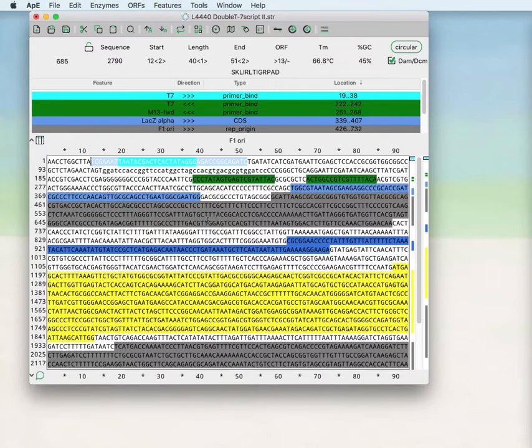Welcome to the second APE tutorial video. This video will show more about working with sequence files.